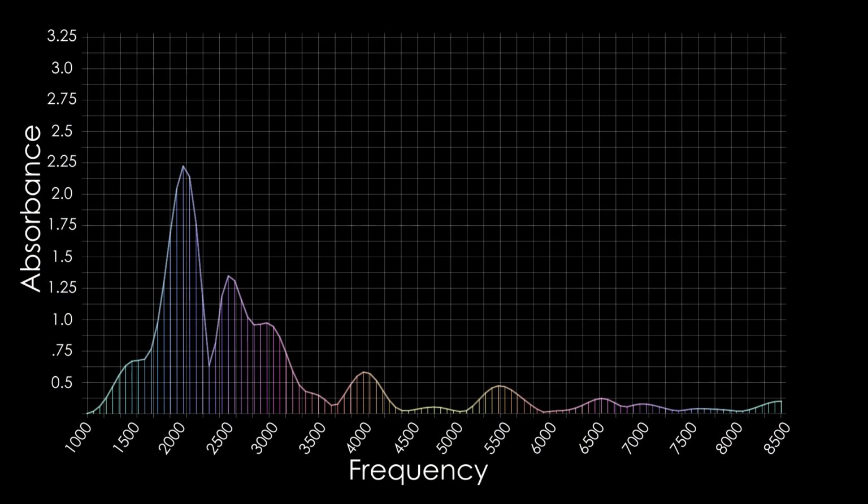It's interesting because it's not necessarily a microscopic image; it's more of a spectra. Your bacteria is giving off a number of different wavelengths, and the combination of wavelengths gives the bacteria a Raman signature, and this signature can be used to identify which bacteria you're working with.